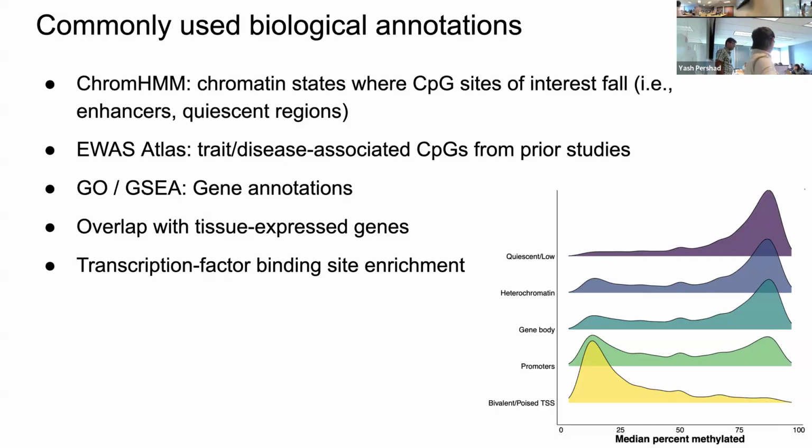So your data will almost certainly look like this if you were to just get average methylation for a genomic region, but you can use ChromHMM, you can port over these annotations for your particular tissue of interest. So they have PBMC annotations that have been done, and this just chunks the genome into, I think it's 16, maybe it's more now, regions. There are options, like 12 or 16 or something. Yeah. And these annotations have been done across a wide variety of tissue types.